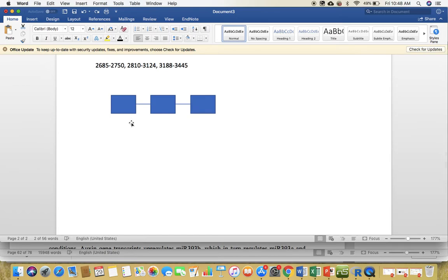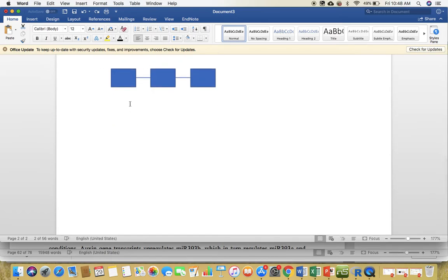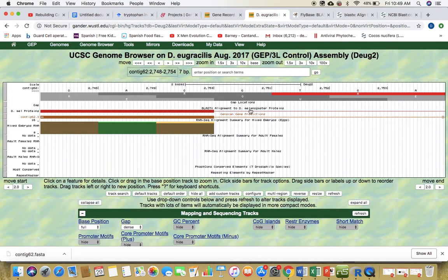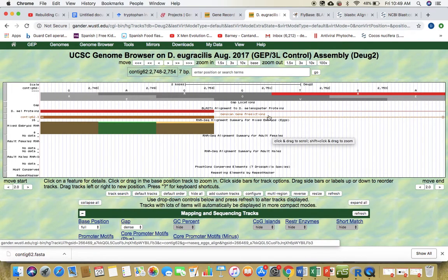What we want next is the splice site donor, because remember, the splice site donor comes at the end of an exon or the beginning of an intron, right? So a splice site donor we said was GT. The splice site donor was GT, so at the end of this first exon here, we look for a possible GT. And remember, this is the positive frame that we're looking at, or the positive strand. So this is GT here. We're looking in this direction, GT.